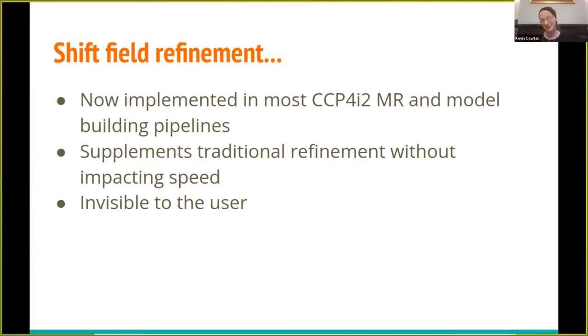So in this case, that decision kind of goes away, because we're now increasingly testing everything against big test data sets of structures, and we're doing that at the pipeline level. So then the person who's building the pipeline can make a decision based on the test set of whether to incorporate a step in a particular case.